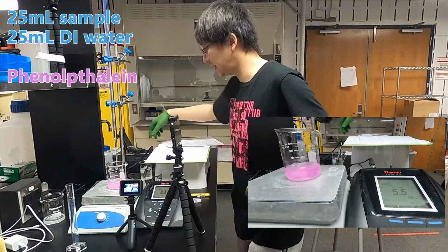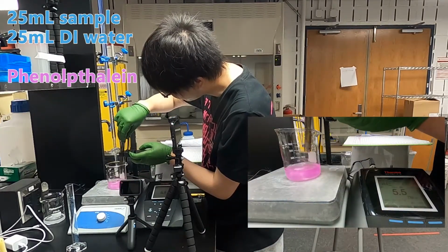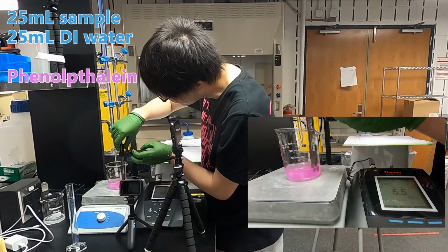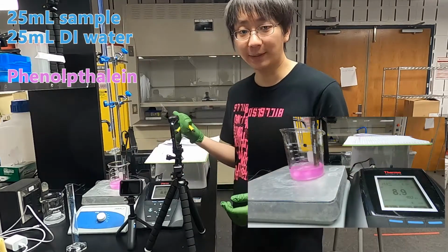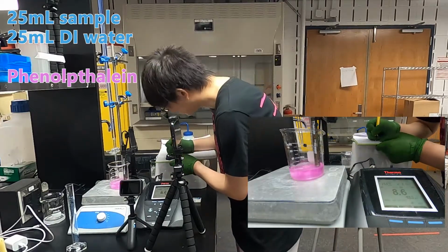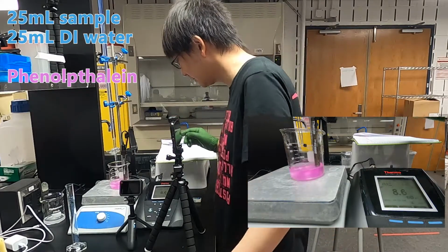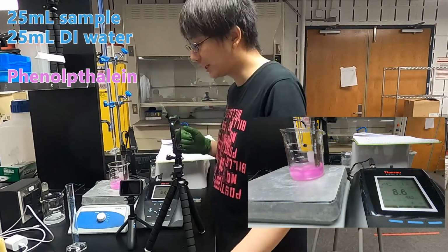Then we measure the pH of the sample. And then when the pH gets stable, we take notes of the pH reading. And then we start to titrate with HCl.